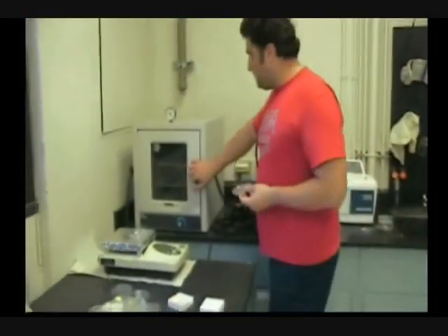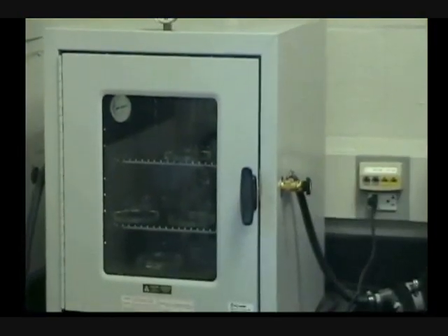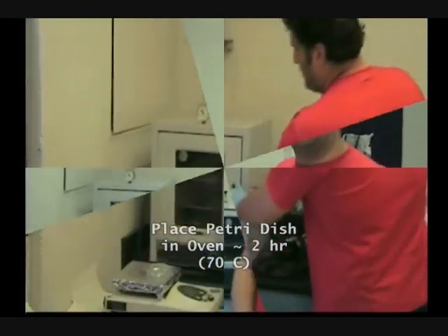Now we need to bake them. Now I'm going to place it in the oven for the baking. Now the PDMS is liquidish. After the baking it will become solid. So we are going to wait more than 2 hours.